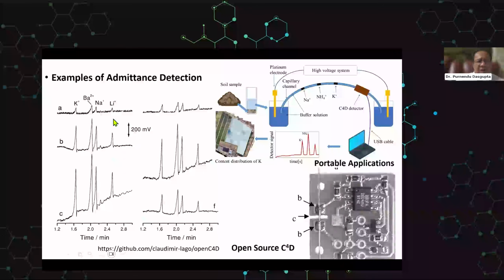And here are more examples of admittance detection. Lots of things you can do with it. It's an open source C4D, and there are lots of uses in capillary electrophoresis.